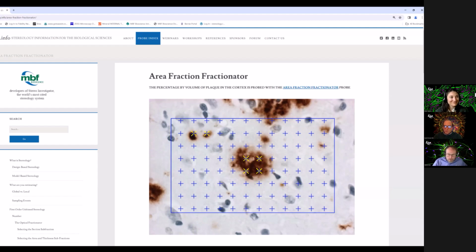Perfect. All right. We did have some questions about stereology and machine learning. AI is obviously a buzz topic. Machine learning goes hand in hand with that. So we do have a product that is coming to market soon. It's currently in beta. So that's in the works. And Aidan, did you have some more information about that?